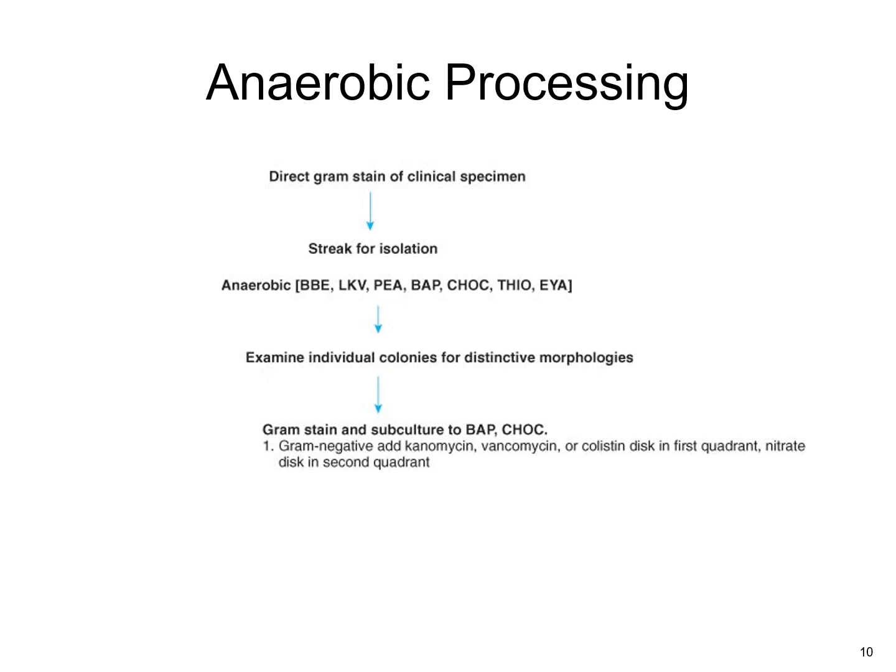So you would also set the cultures up, so you'd streak for isolation, and you would set it up on the anaerobic media. Each facility picks which particular media they want to use, so they know which organisms are more common in their area, so they may base that on what their area presents with.